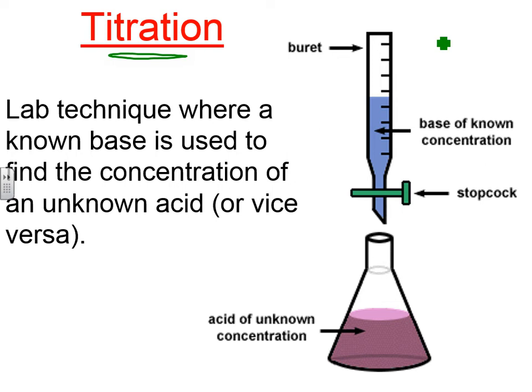So usually you have the use of something called a burette. A burette is an instrument that is graduated. It has numbers, like 15, 16, and so forth. Actually, the 16 would be down here. It's graduated from top to bottom. The top numbers are smaller, the bottom numbers are bigger. And it allows you to measure exactly how much liquid is coming out.